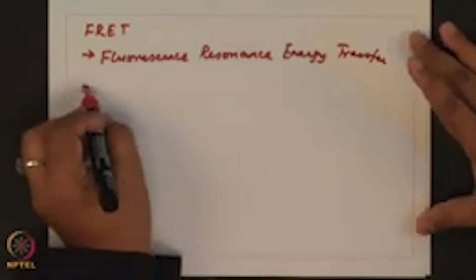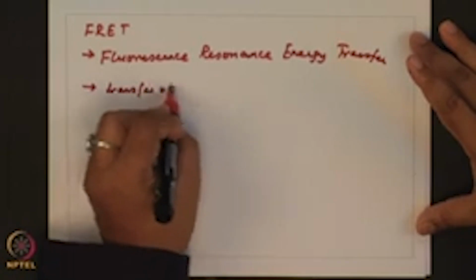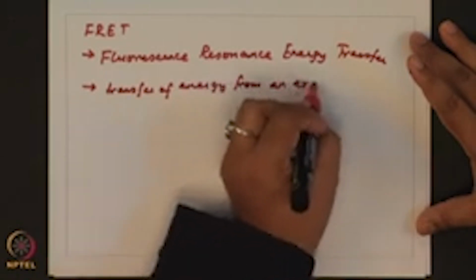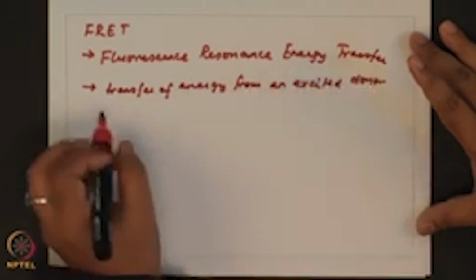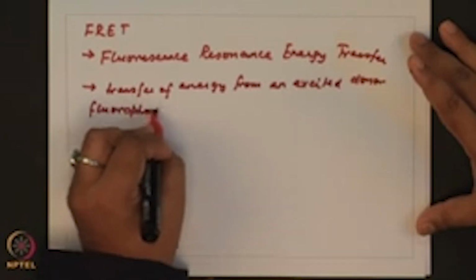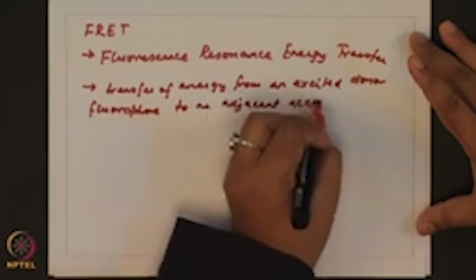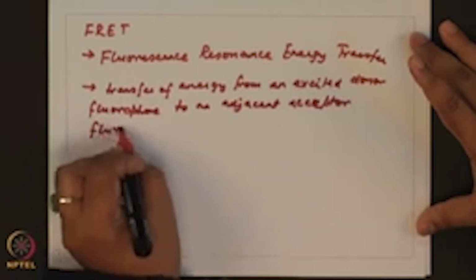It involves the transfer of energy from an excited donor fluorophore to an adjacent acceptor fluorophore.